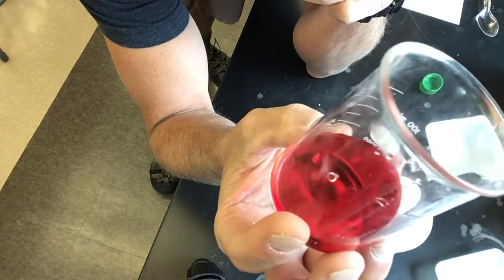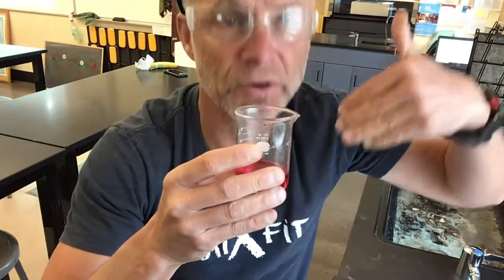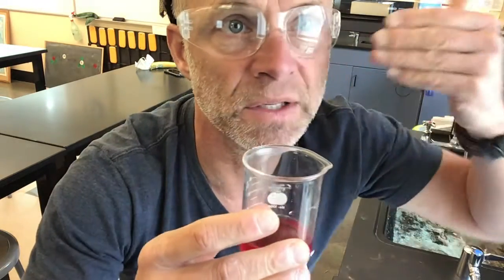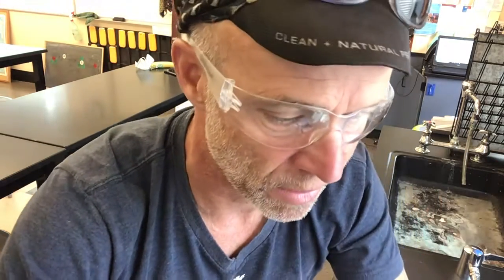It's liquid. If you're going to smell it, there's a proper way to smell this. You're going to waft it to your nose. Do not stick your nose in it because it could be something very strong. So we just waft it. Also, notice I'm wearing my safety glasses, and you will too when you're in lab.